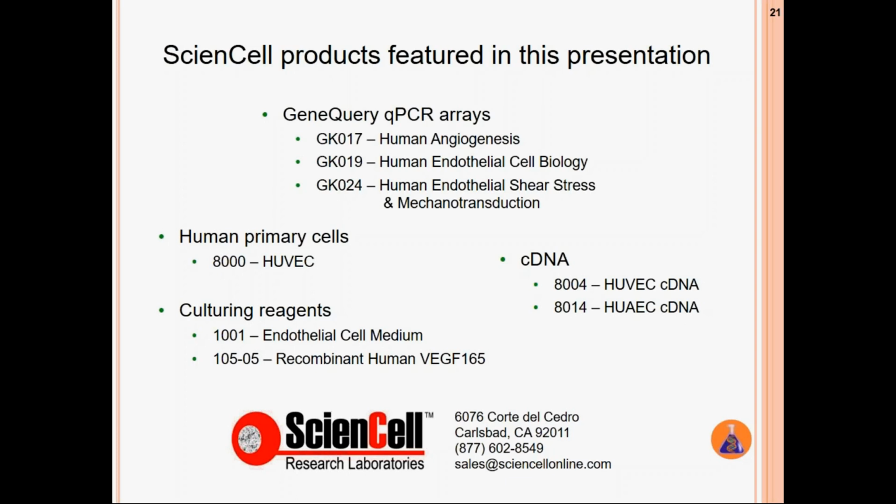Okay, here's another question. What kind of samples can the arrays use? The array should use the complementary DNA samples that are transcribed from your total RNA samples.